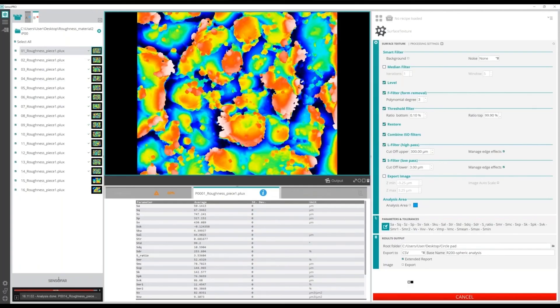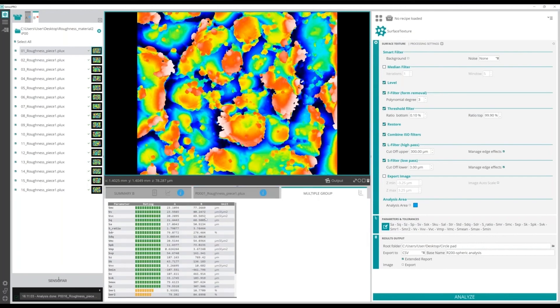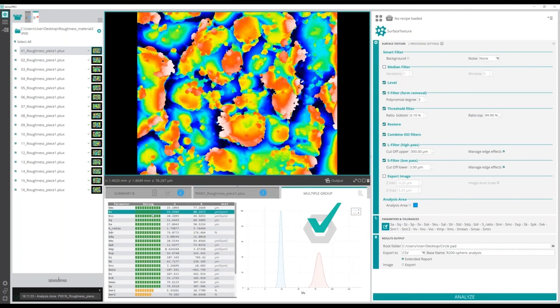Senso Pro also gives the possibility of parameterizing a characteristic of your sample by giving you the parameters that can distinguish a dataset of non-compliant piece from a dataset of a compliant one.